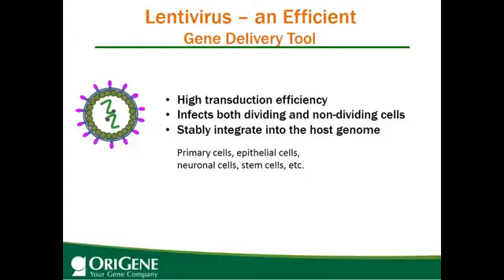So this is a summary slide showing the features of lentivectors as a gene delivery tool. It's high transduction efficiency, reaching 90 to 100% in commonly used cells. It infects both dividing and non-dividing cells. Another important feature about lentivirus is it can stably integrate into the host genome, which is better for creating stable cells.